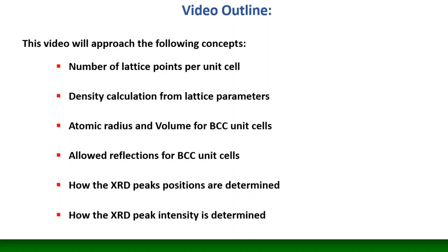And then, going to more general cases, how the peak positions in the X-ray diffraction peaks are determined. We'll be using an example for a cubic unit cell in this case. And also, in more general lines, how the peak intensity of XRD peaks in a diffractogram can be determined. Remember that everything we talk about regarding X-ray diffraction here is valid for and focused more on powder X-ray diffraction than on single crystals.